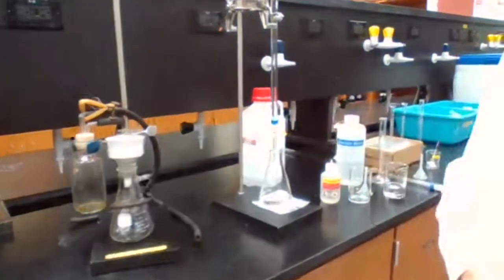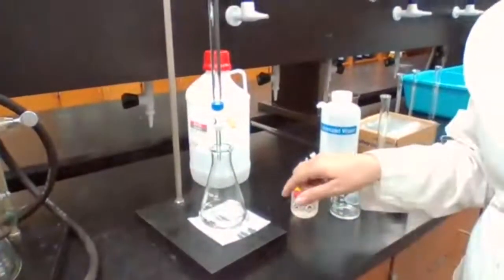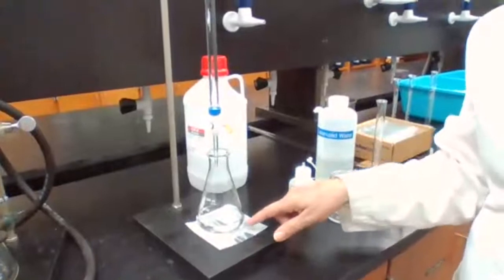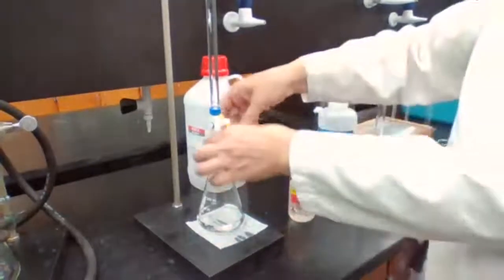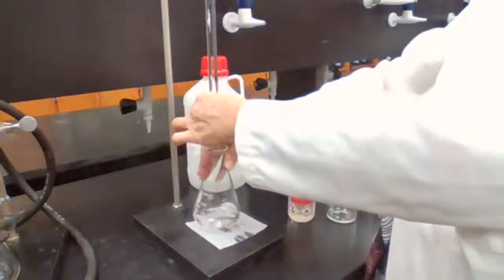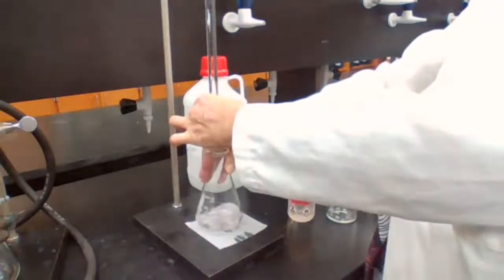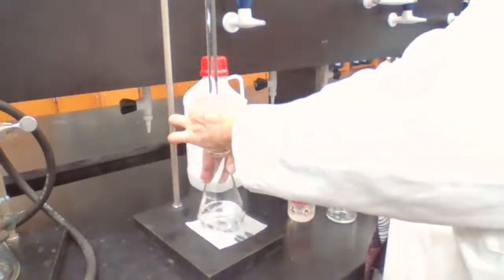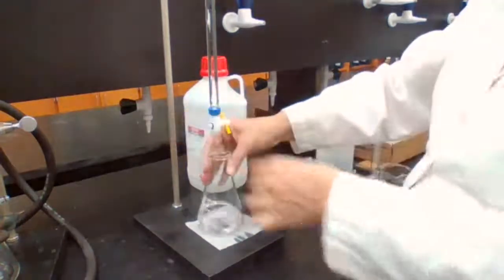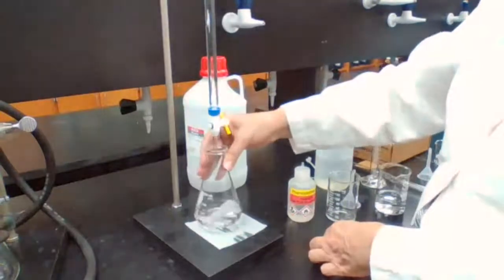If I bring the camera closer, you might see the pink color in the center, it appears and disappears. See the pink color? It's in the center. I'm going to add enough until the pink color stays for 20 seconds.